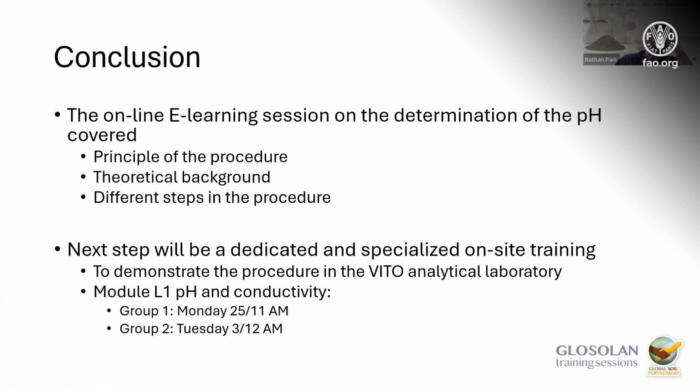So what happens if your duplicate analysis of pH fails in one of the batches or is outside of the limits? What happens there? If it fails, we often redo it. And we also check the initial sample, to see if it looks heterogeneous, yes or no. But it's a repetition of the sample. If the duplicate is not okay, you cannot have a lot of influence on it, but you can check what the possible causes are.